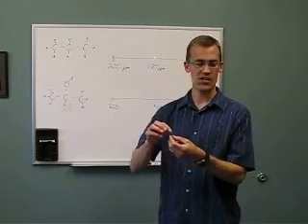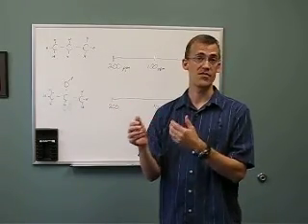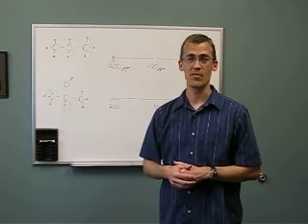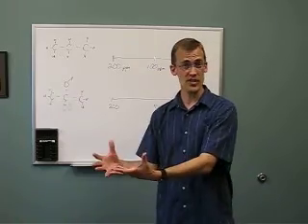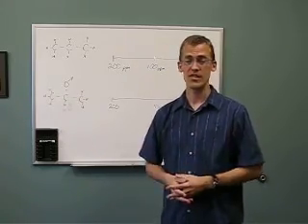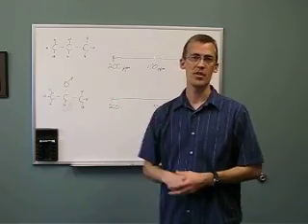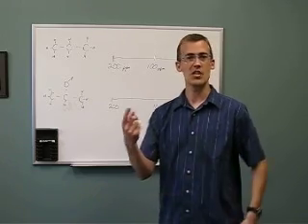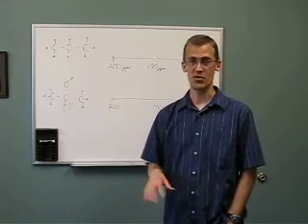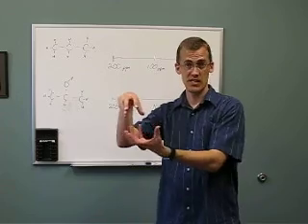Infrared light doesn't cause electrons to become excited into new orbitals, but it does cause bonds to vibrate. So you can learn something about bonding, and it's also a very good tool to identify molecules. But if we get to the radio frequency range, RF, that's what we're using in NMR, it can cause the nuclei of atoms to flip their spin orientation. So if you imagine that nuclei are filled with protons, nuclei have charges, and if they're spinning, it creates an electromagnetic field.